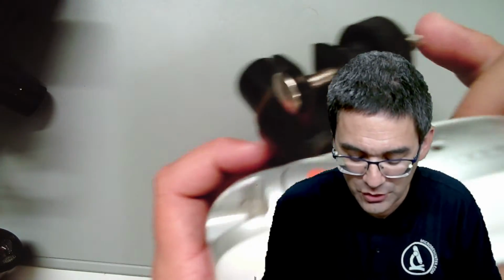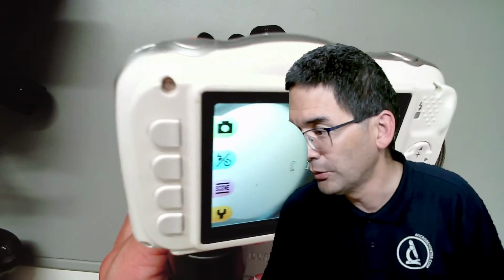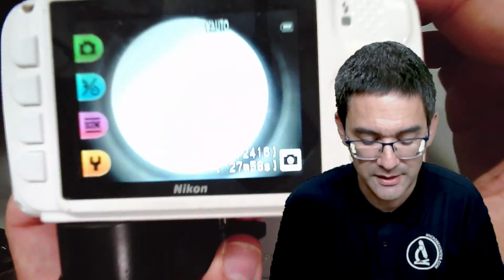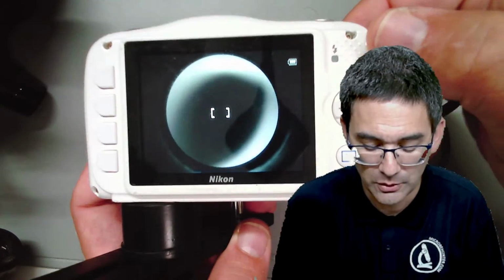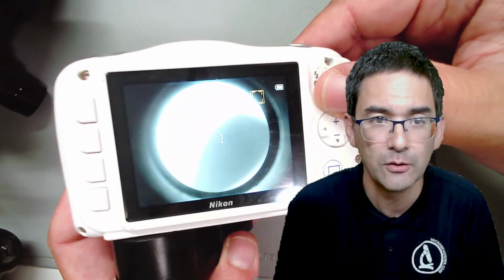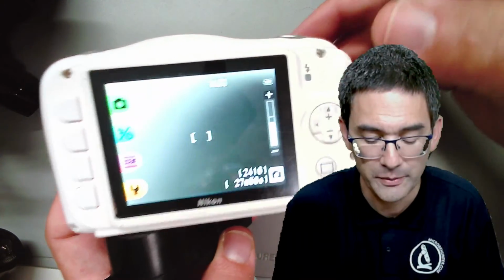Okay, I also want to show this to you. Okay, need to switch it on first. Does this work? Yeah, okay. And I'm going to quickly show this to you as well. Just a second. See, you can already see it here, that you see a circle. And you know what? I'm going to do it like this. I click the plus. Plus is optical zoom. And you see that you're able to zoom in.